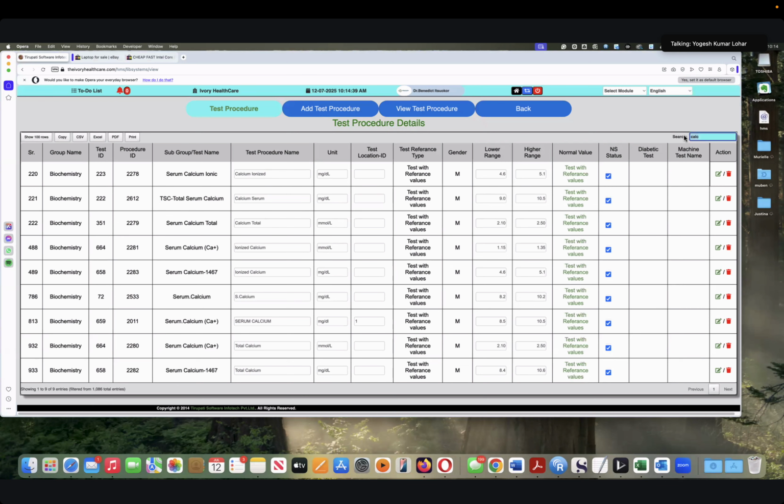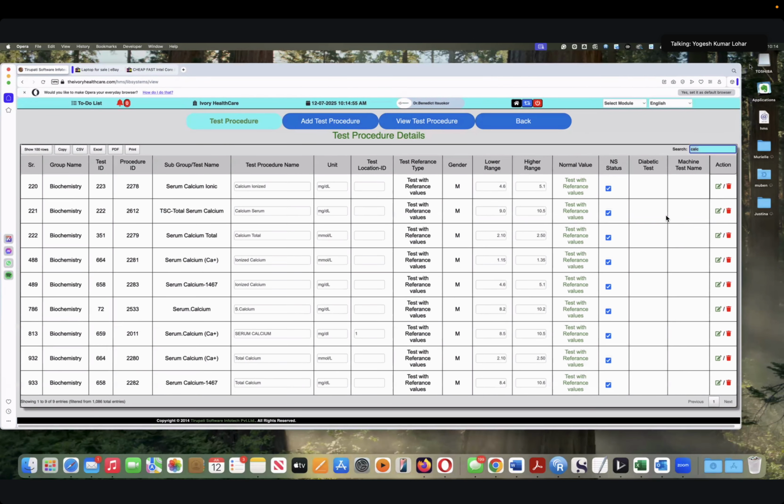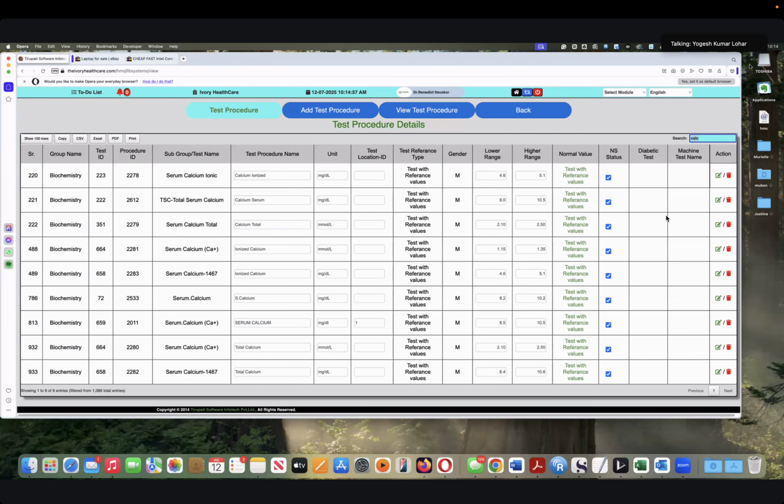Okay, after that, can you show your Excel file so that I can take the reference? Please bring your laptop and open the Excel, one minute. Okay, sorry my friend, just a second, I am opening the respective Excel file that is the reference. We can consider which tests you want to allow. One second, sodium, potassium, calcium.